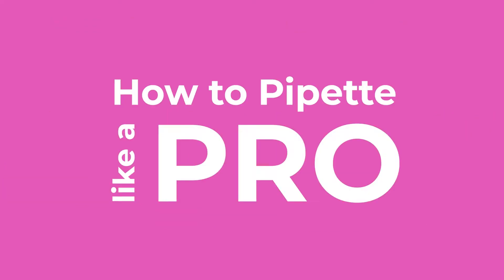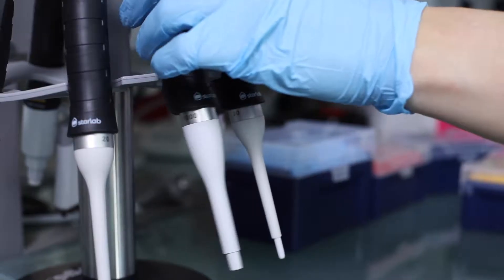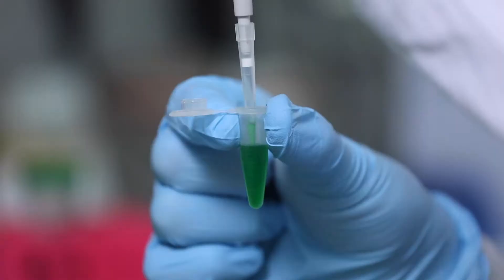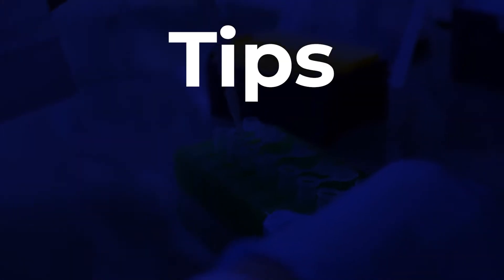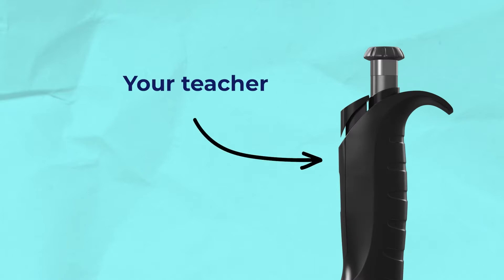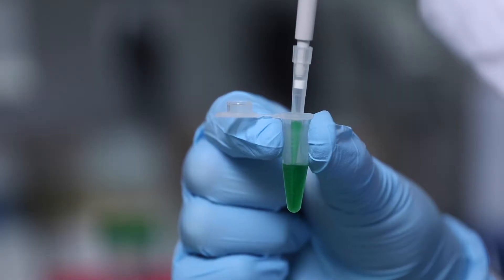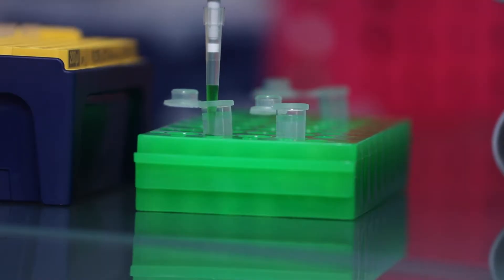This is how to pipette like a pro. We are going to cover the most important tips and tricks to get you up to speed in no time. Your teacher? Well, it's me, your Ergo1 pipette — the only one that's really qualified to be giving you advice on this subject. And today, I'm going to be talking about pre-wetting your tip before pipetting your sample. Let's get started.